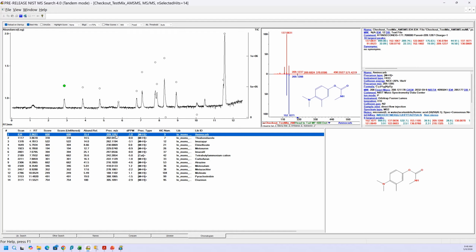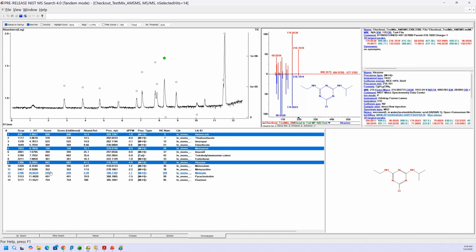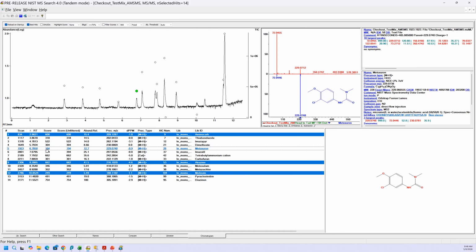The other thing that you need to know on your keypad is to use the Control key. If you want to select things or deselect things in a certain order, let's say I want to select this one, I hold the Control key down, I go to the fifth hit, I go to this one, and you can just select whatever you want. And if you select it again, it deselects it. So if you have a long list, you can deselect. So learn how to use the Shift and the Control key on your keyboard to get the data in the right format.